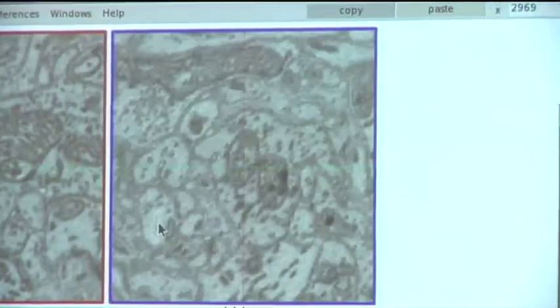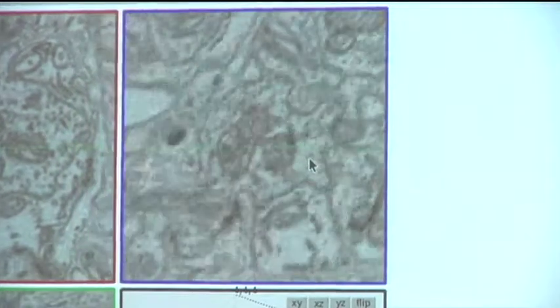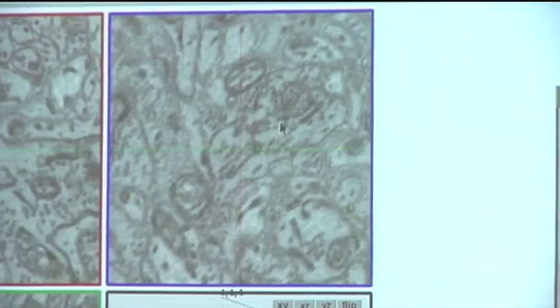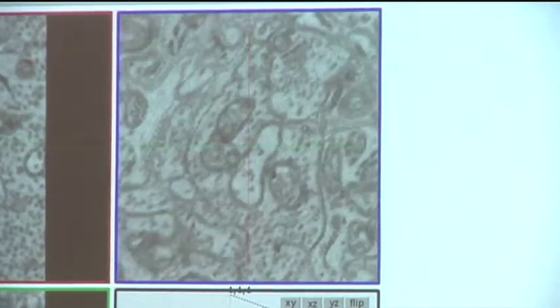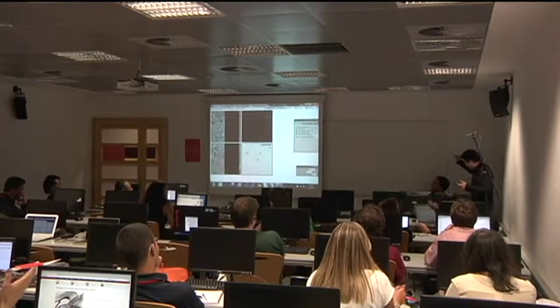Now careful, careful. Mitos in view, yeah. Go on, go on. Time is still running. Yeah, now it gets really wow, right? Whoa. Very big. So this is an axon terminal, as you can see, many vesicles, and it's making synapses all over the place. Stick with it. Yes, go, go, go. And blank, done. Very good.